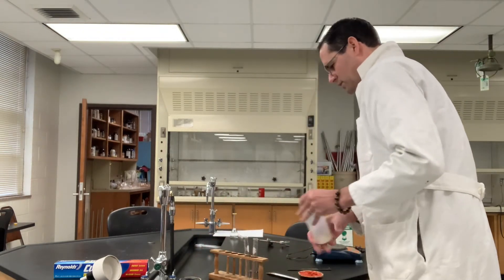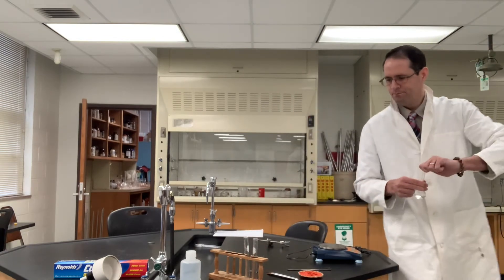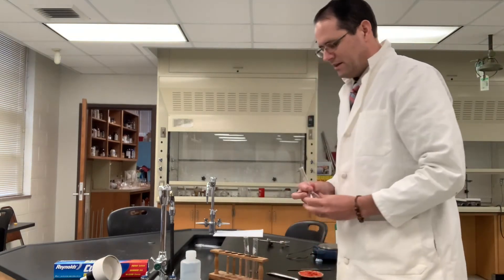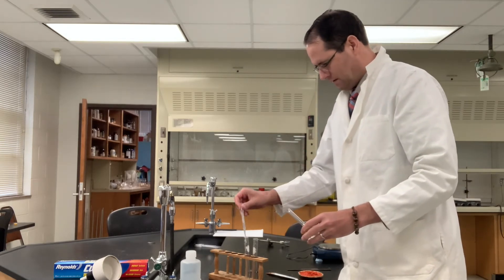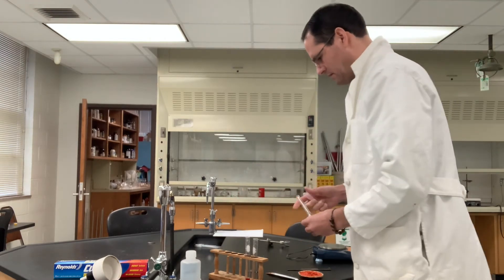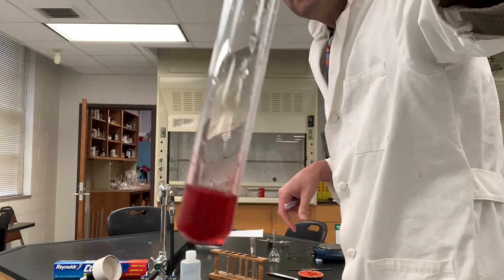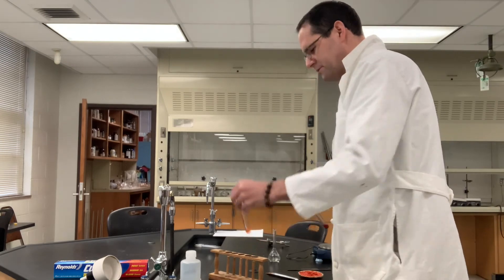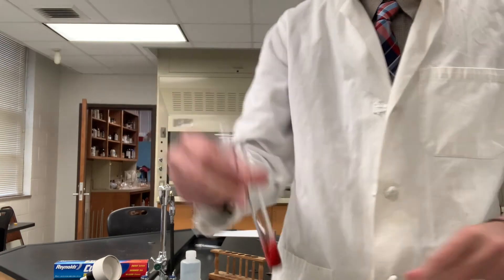Now we will react methyl orange with hydrochloric acid. That's the color there — so kind of a yellowish orange and a red.